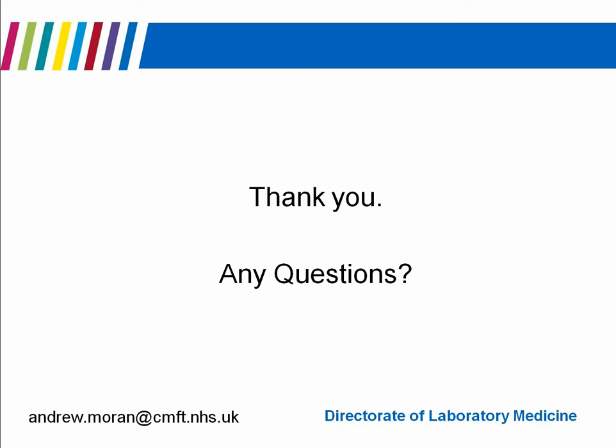I've got a question for Andy. How long does it take, do you think, to get somebody to be competent and then to maintain that? So it's coming at it from a slightly different angle to what you were asking. Is the time invested worth the effort? Certainly, I think from our point of view, the more staff that you have who are able to carry out the flow work, the better.